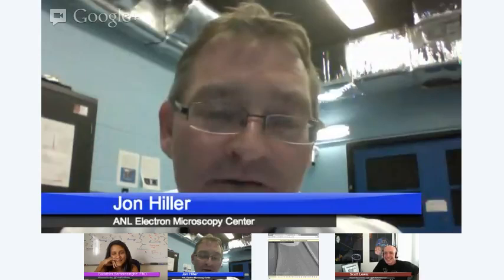And so now the ion beam, wherever you're scanning, is not removing material, but it's interacting with the gas precursor that you've introduced, and it's now going to deposit, so you can now grow structures. Right. Wherever the ion beam is scanning, it's not going to remove the material because it's interacting with the gas. And once it cracks the gas precursor, it's an organic compound, mm-hmm, and you can deposit structures. So it's like embossing instead of carving.